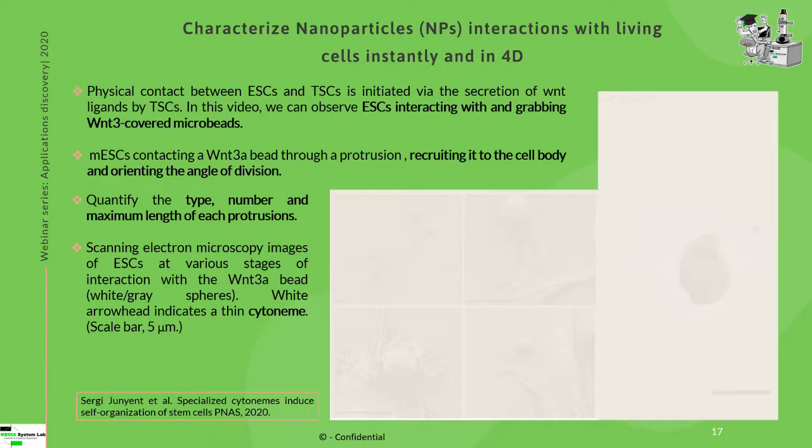That is in some way reproducing the interaction with the trophoblast cell. The interaction is really excellent to see. So it's a recruitment, and then the cell is going to orient the angle of division. We can monitor how this interaction is going and what is the effect on the cell division due to the interaction with the beads.